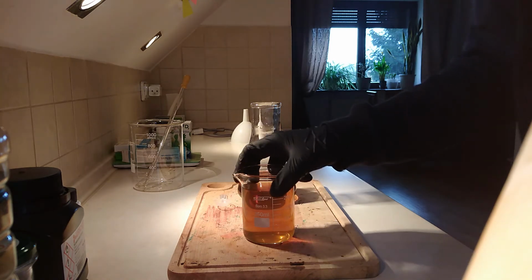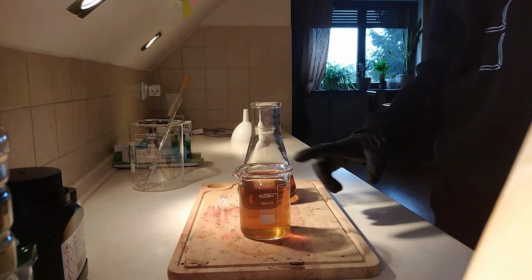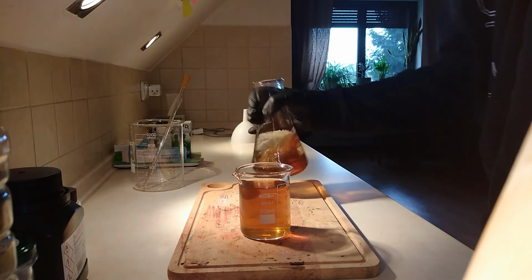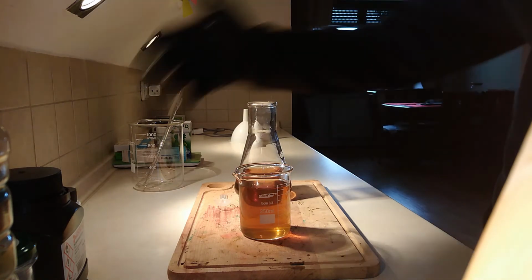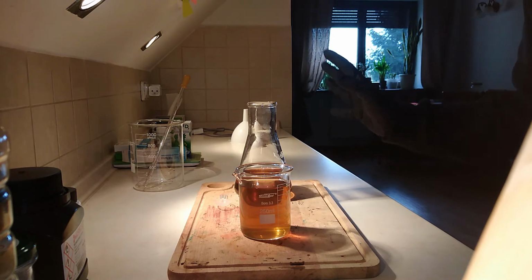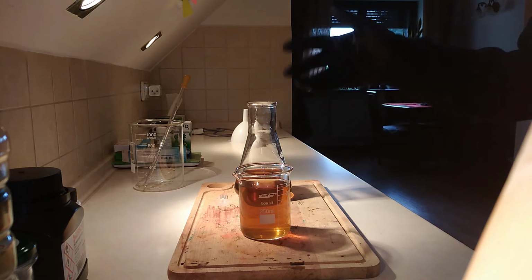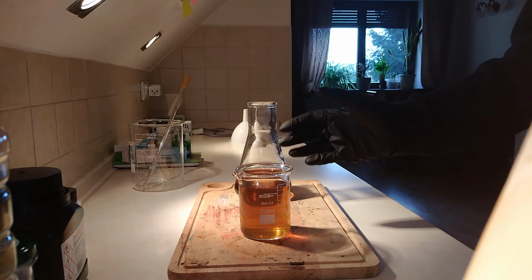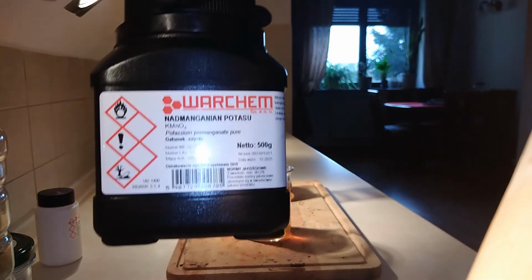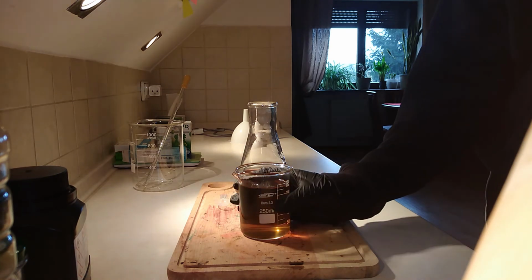So yes, deal with the waste properly. If you don't have access to a proper chemical tank to pour everything in and forget about it, you may want to dump it into the drain. But remember, do it with an enormous amount of extra water. Because as you can see, the stuff at the bottom is bad for the environment.